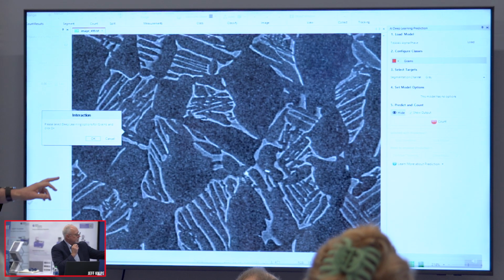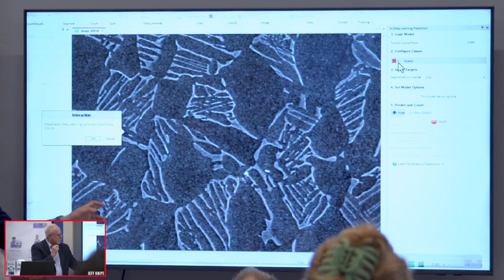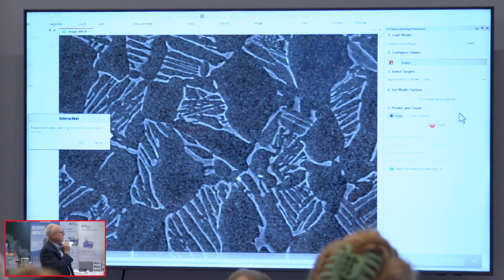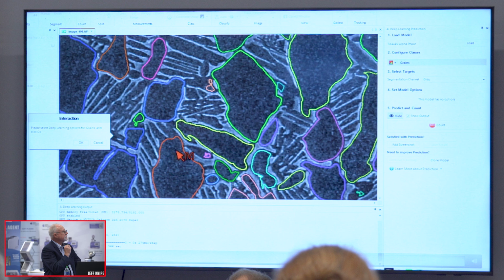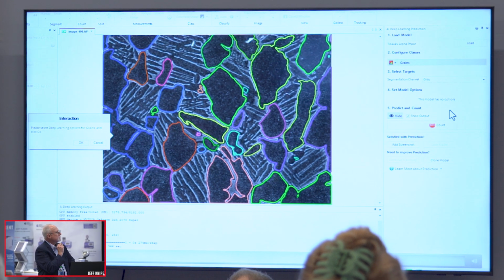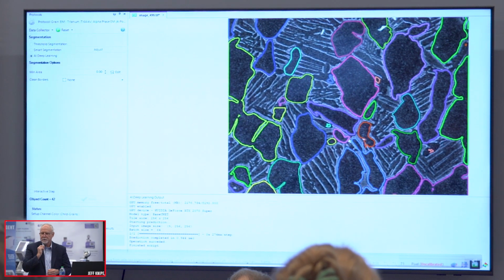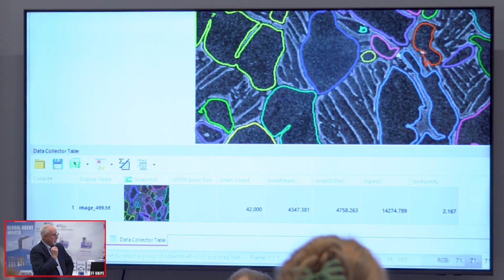And now again, these are all the same, really grain levels and texture, or grade levels and texture between this structure in here. And this is the power of deep learning, that you can avoid all of it. See, if you were trying to gate out these small areas, it's pretty hard to do. So that really highlights what now you can do in solving more applications, solving more analysis problems with a properly trained deep learning model.